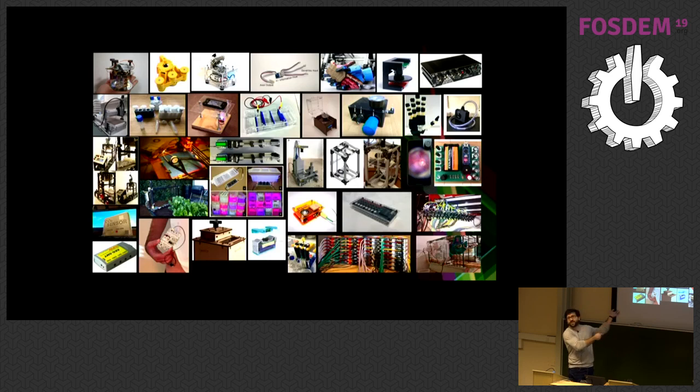One of the ideas we had lately was to make a smaller version of this and have this take care of plants inside a lab, right? So basically this device will take care of everything by taking care of the probe plants and things like that, right? So there are many, many people doing many, many cool stuff out there. And so we want to see if this becomes a new norm.